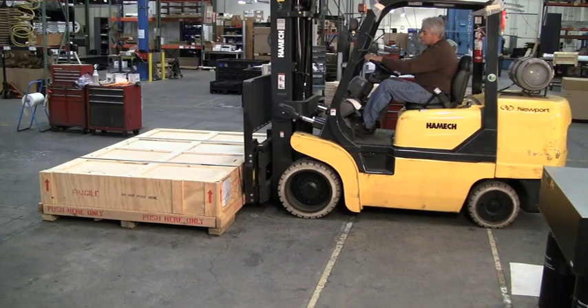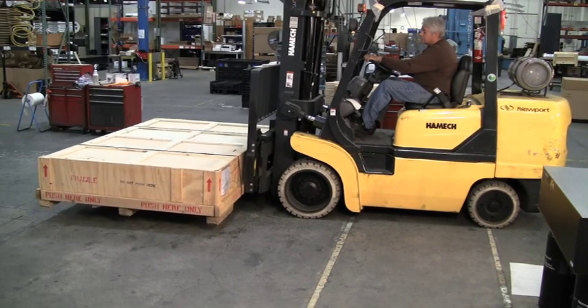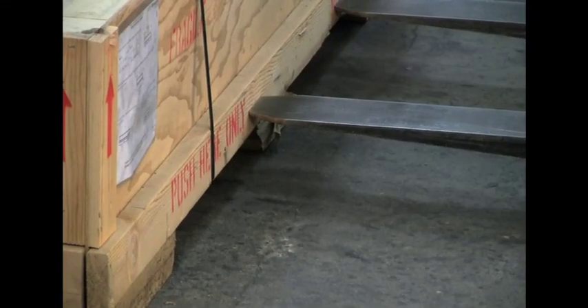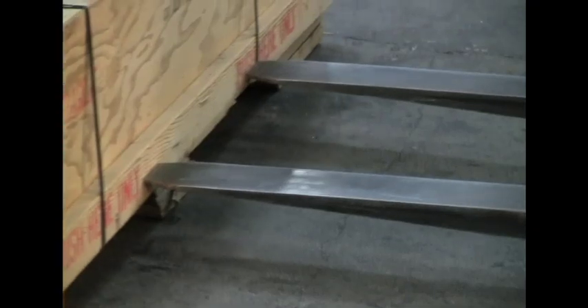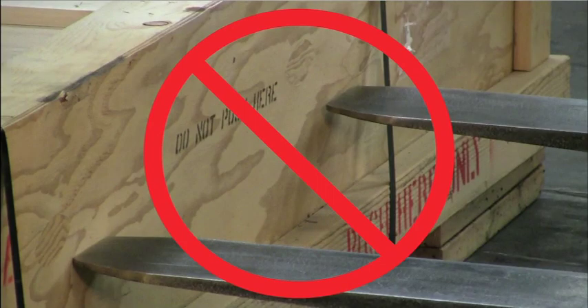Use proper lifting and maneuvering techniques to move the table to its unpacking location. This includes lifting the crate from the bottom and only pushing against designated areas when necessary. Under no circumstances should you attempt to use a forklift or other blunt tool to push or lift the crate along its sidewall or top, as this may result in damage to the table.